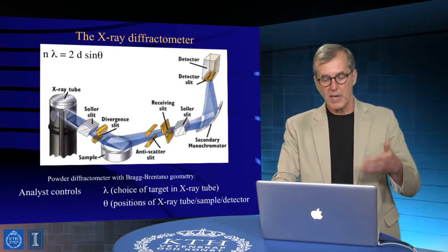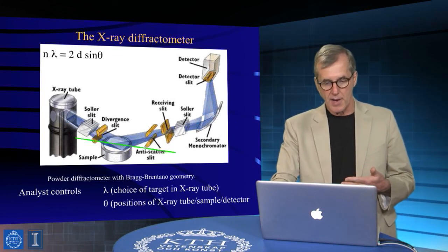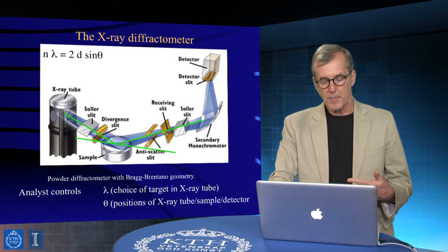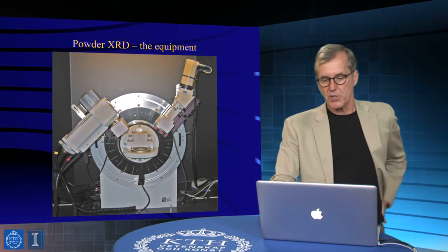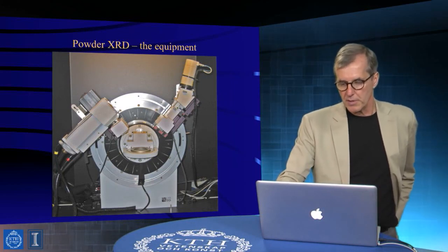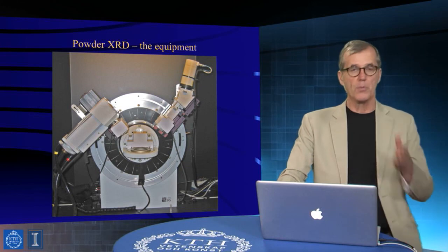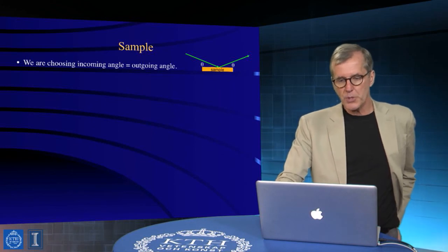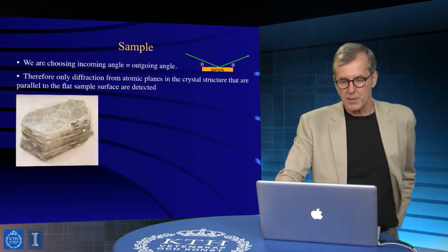Basically the position of the X-ray source and its disposition relative to the sample, and the disposition relative to the detector, right? And so all these angular features are things that you would pick as a way of doing this experiment, and so for here, the entering and scattering angles are specified, and that's just a picture of one of these type of instruments in our analytical facilities at Illinois, and you likely have similar things here at KTH. Okay, so we choose the incoming and outgoing angle, and thereby the diffraction planes that we're going to assess.